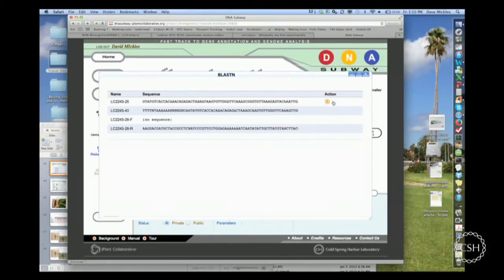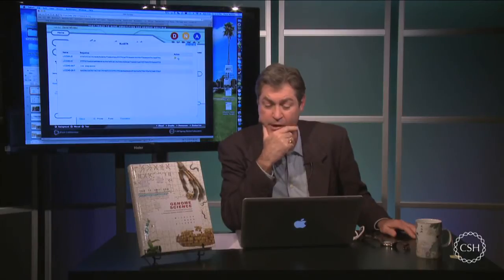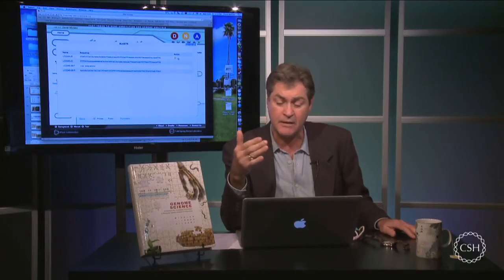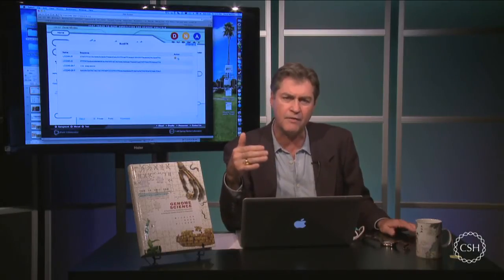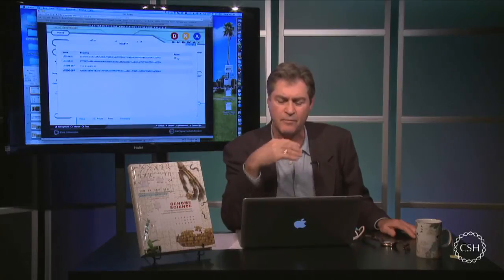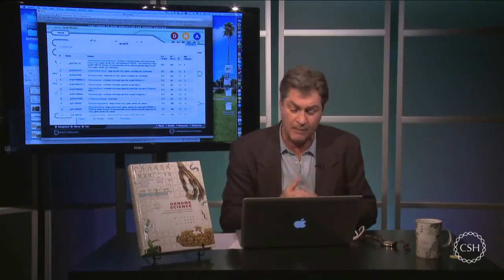Now we're getting a real BLAST search, because this one wasn't cached, because I hadn't done one in a long time, so it cleared the cache. So this is the amount of time you can expect to do a real BLAST search. This is calling the BLAST server at the iPlant Collaborative, which is essentially a mirror of the BLAST search at the National Center for Biotechnology Information, or NCBI. But you can see it came back pretty fast.